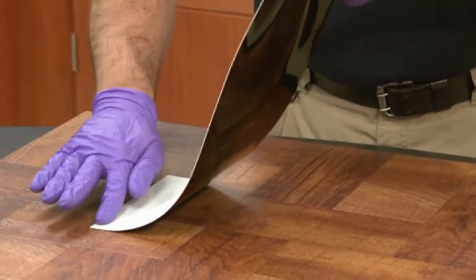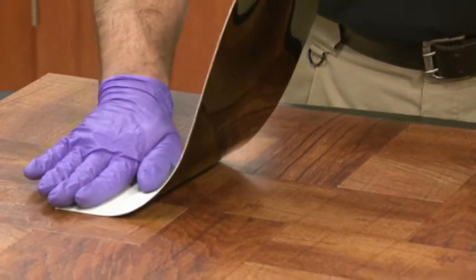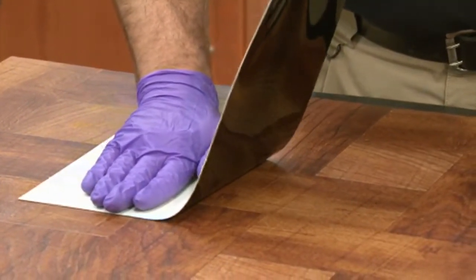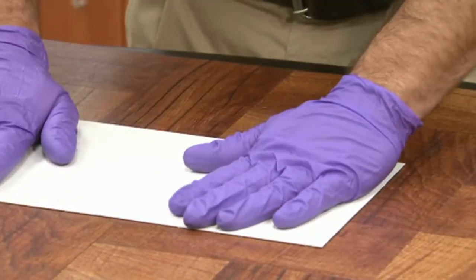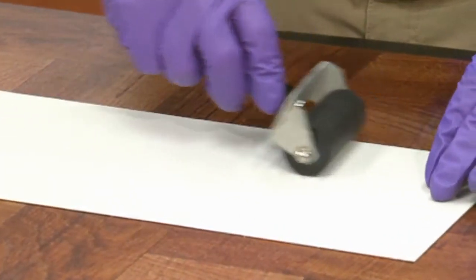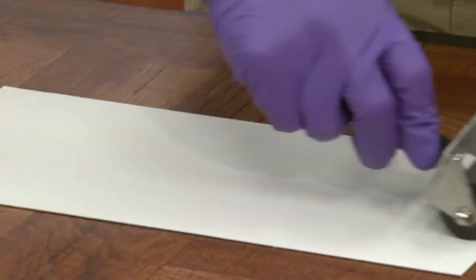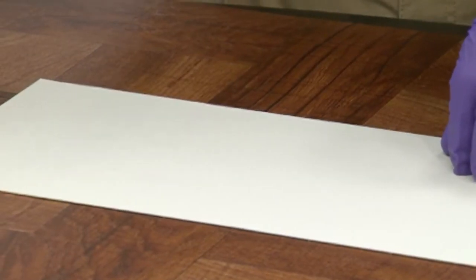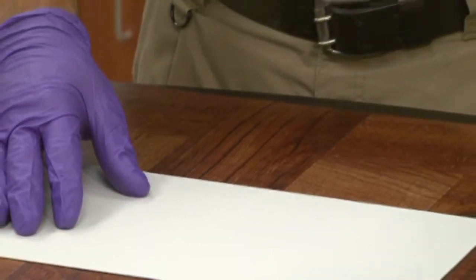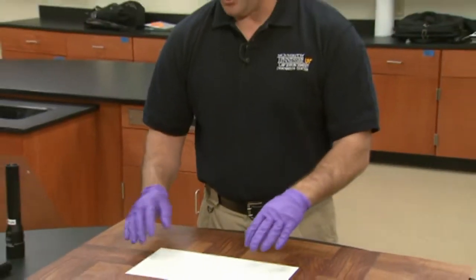In this particular case, I know that my footwear impression is just slightly in front of where I've tacked down this end, and I'm just going to kind of smooth it down as I go. Once that's done, you can make sure and get any other air bubbles out by using a roller or some other item to smooth it down. Gel lifts should be applied for a minimum of 10 minutes because that allows the gelatin in the material to actually absorb down into the material and pull up whatever evidence is there.